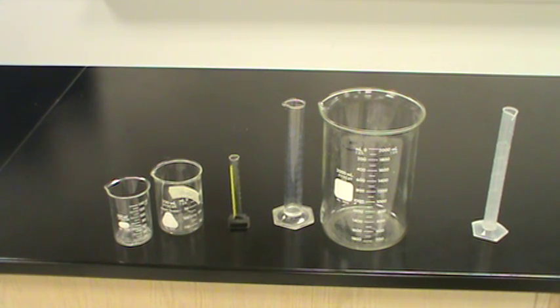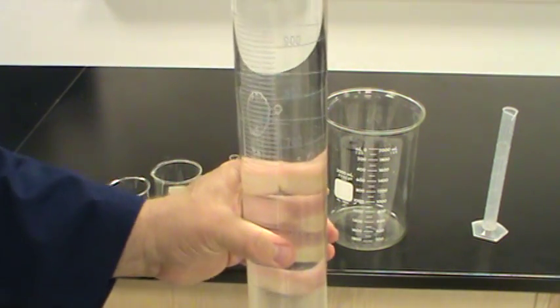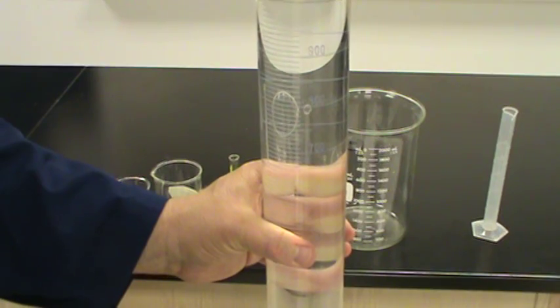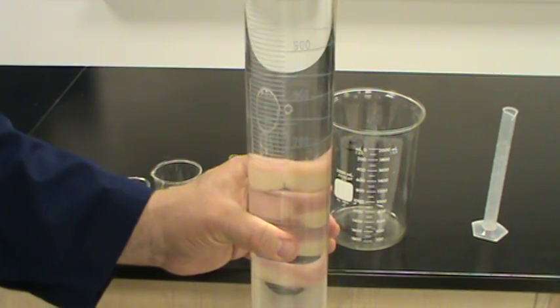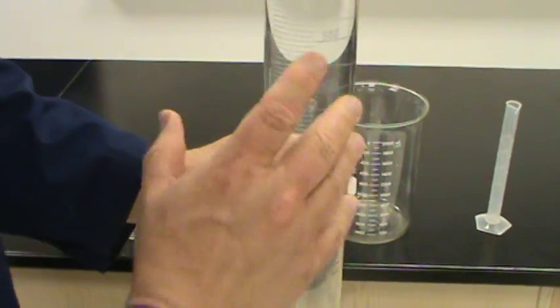And a little bit more. Let's see if we come out about right. Oh, just slightly over. Let's pour a little bit out. Hate to do this off camera but I have to. Just bear with me for a second. And there we go. Okay, we have approximately 1000 milliliters of liquid in this container.